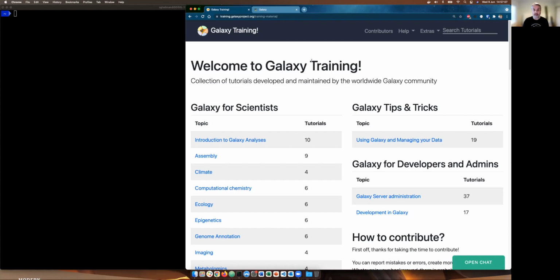And in this session we're going to be talking about using Singularity to run Galaxy jobs for us in containers. Okay, let's get on with it.